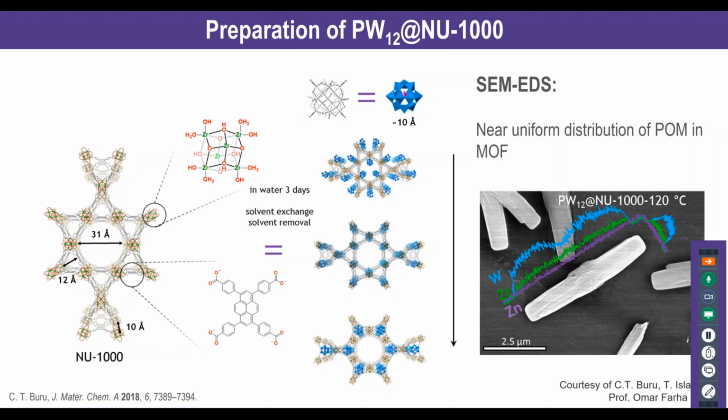One thing they're interested in here is to include those PW12. They are catalytic particles, and they want to embed them in MOFs. They are very interested in looking at the position of these dopants in the MOF structure. It's a long way to get there in terms of images, and it's a very complicated type of experiment. It's much easier now with the direct detectors, but it's still a combination of knowledge of electron microscope, TEM in general, and also synthesis and sample preparation, especially here.